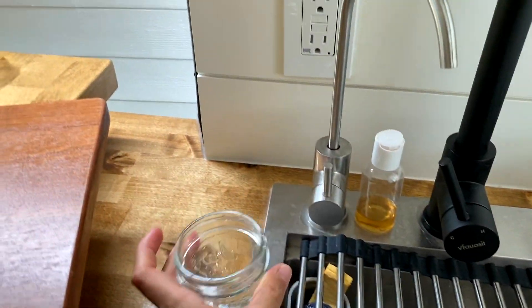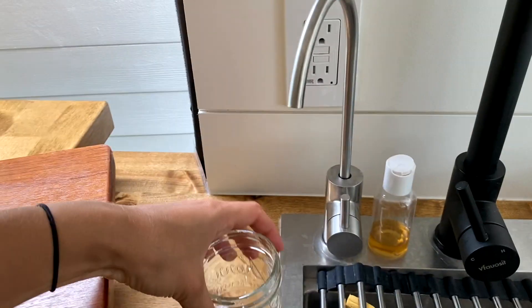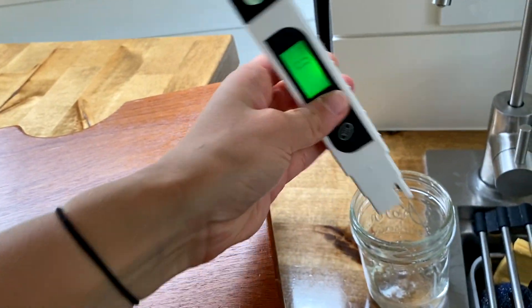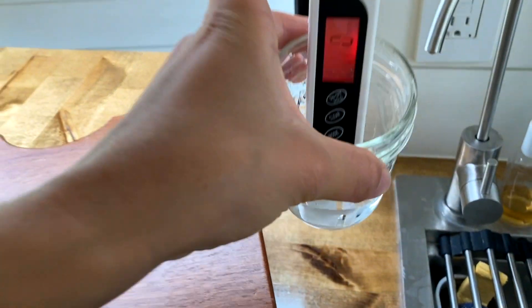We were traveling and relied on filling up water at different places. This is the TDS meter that we relied on and highly recommend, but there are some things to note.